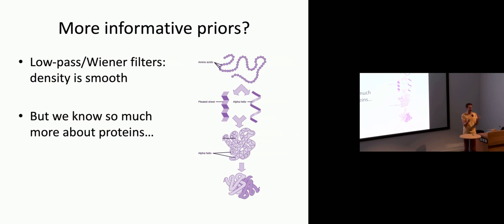So it seems like there is a lot of prior knowledge that I could use for regularization, but it is not being used at all, because making a mathematical equation that optimizes the presence of amino acid chains in a map would be complicated, right? That was the main reason why Relion used this smoothness prior, because it has that beautiful formulation in Fourier space, which I can just derive all the way through.